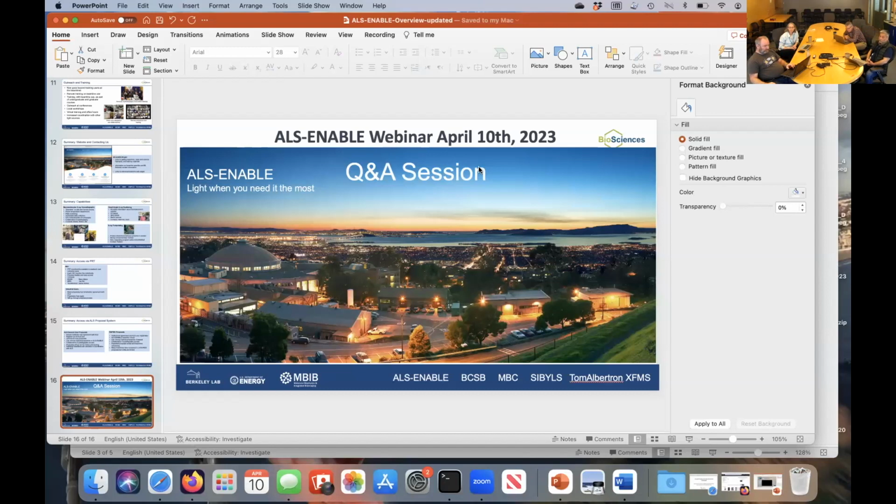And we're also not just talking about our individual beamlines and our individual programs. With ALS-ENABLE, we are really working together and sharing resources, including staffing, so that we can get more things up at night and turn things around better. If I'm slammed, you can ask Mark or James, hey, this experiment needs to go, do you have time? That kind of thing. If you are a member of CERCAT, then CERCAT has secure beam time on the BCSB beamline, so you can just contact us or contact your CERCAT manager, basically. You might be a member of a PRT and not even know it.